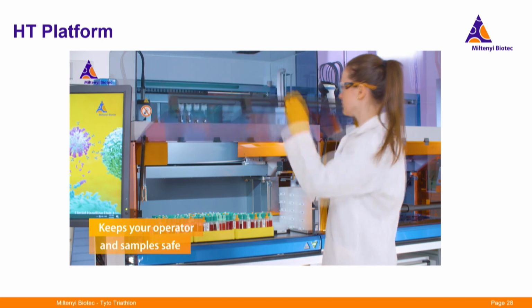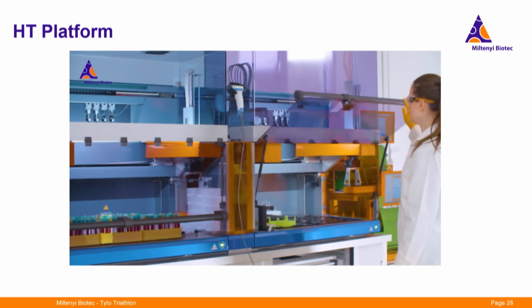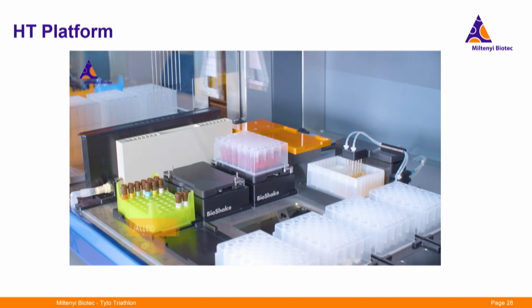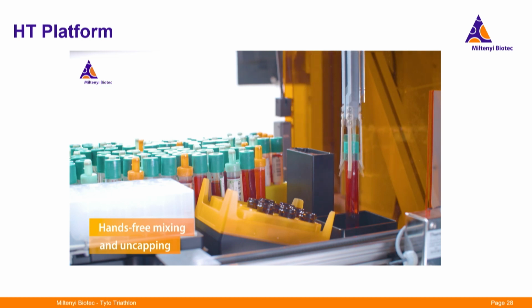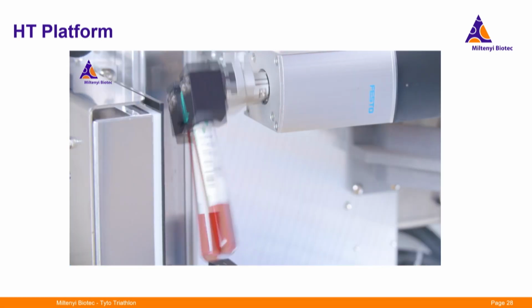liquid handling systems. Here you just put the sample on, so the blood collecting tubes, and then that is a barcode reader that detects the barcode. The reagents, so the chemical liquids, get detected, and here we can see it pipetting. And here it collects the tube. The collection tube goes down to the decapper, and here it gets inverted, shaken.